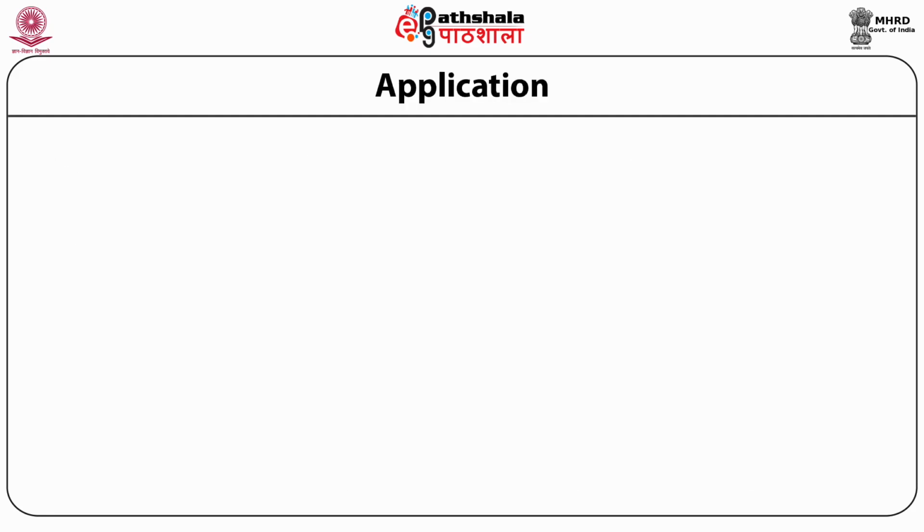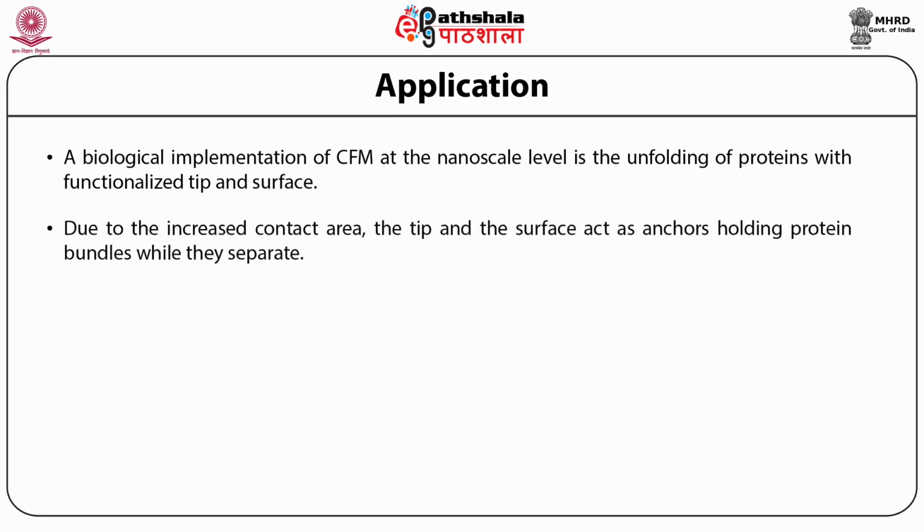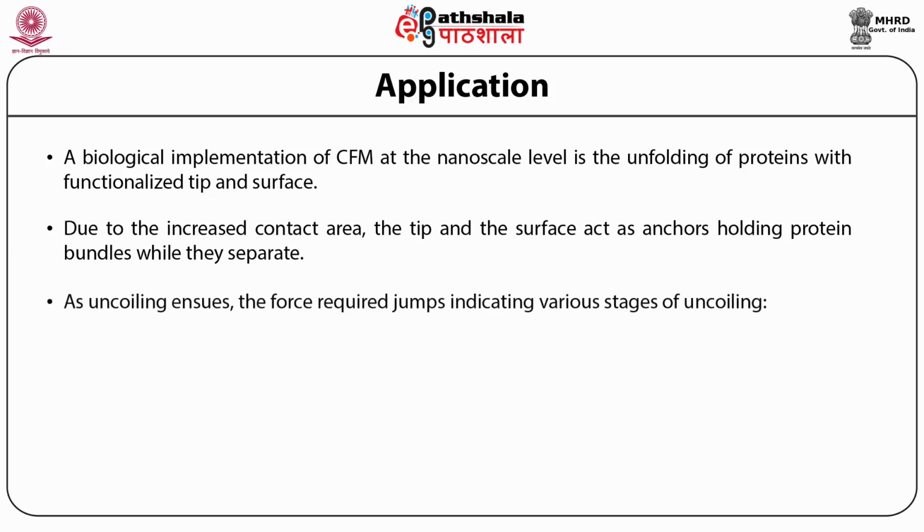The applications of this phenomenon. A biological implementation of CFM at the nanoscale level is unfolding of proteins with functionalized tip and surface. Due to the increased contact area, the tip and the surface act as anchors holding protein bundles while they separate. An uncoiling ensues.